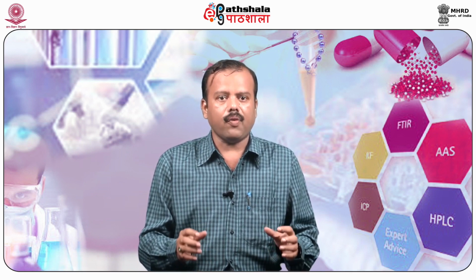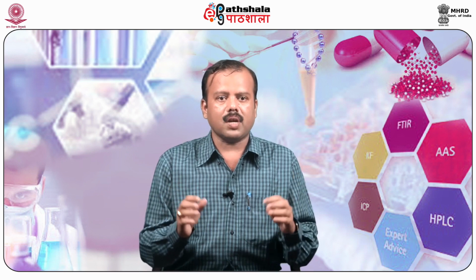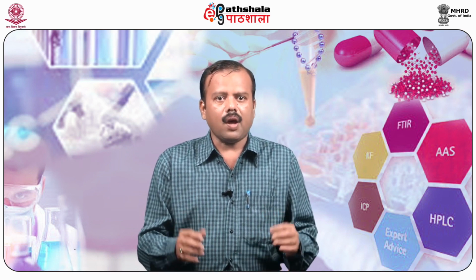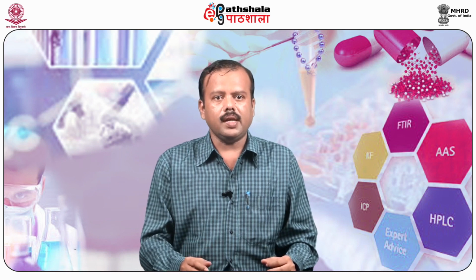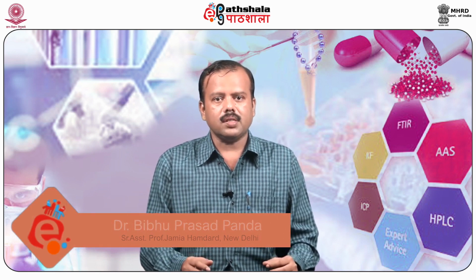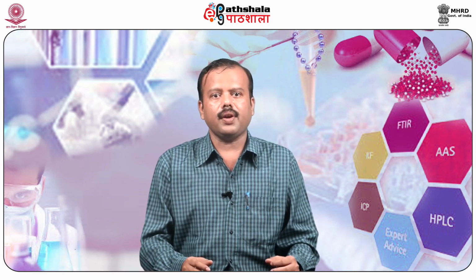The number of dead and live cells in the inoculum must be controlled for depletion of assay substances. Diffusion of chemical substances before incubation is essential for a better and accurate result. Incubation conditions must be uniform during the test procedure for an accurate result.